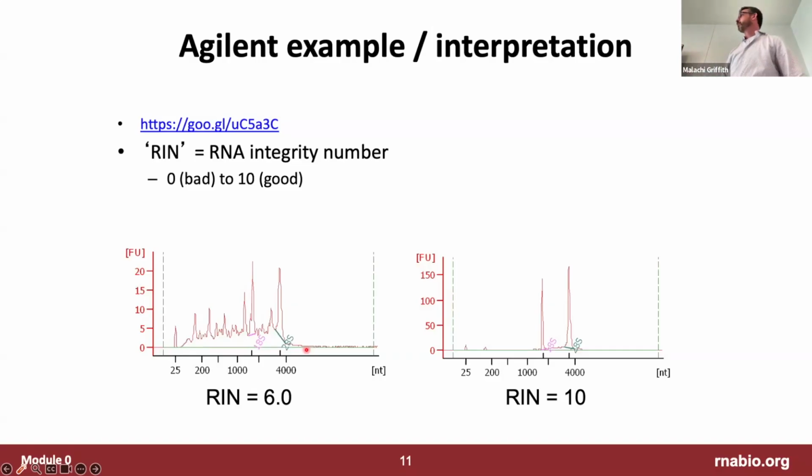There are some sequencing facilities that will ask you to run such an assay, or the first thing they do when you send them your sample is they will run such an assay. And if the degradation appears quite bad, they might hit you back with an email saying, hey, it seems like your RNA is degraded. We generally don't like to make a library if the RNA integrity value is below 5 or something like that. And they'll often say, do you still want to go ahead? And then you'll say yes, because you did all this work to isolate that sample. And then you hope that your data is still good quality, but you remember in the back of your mind that there was this issue.